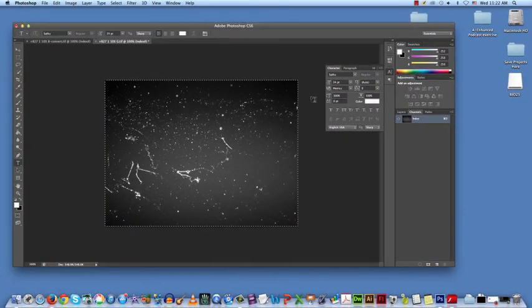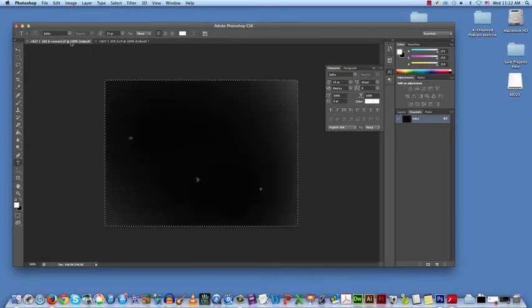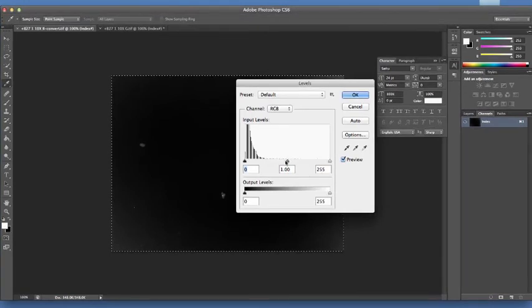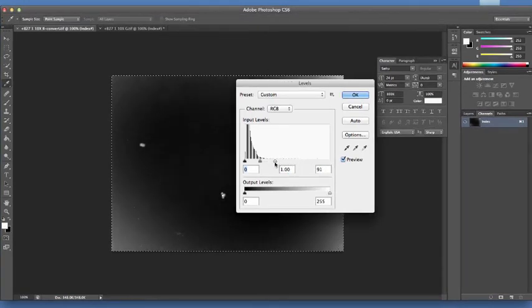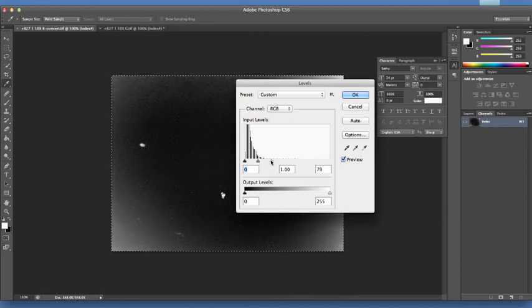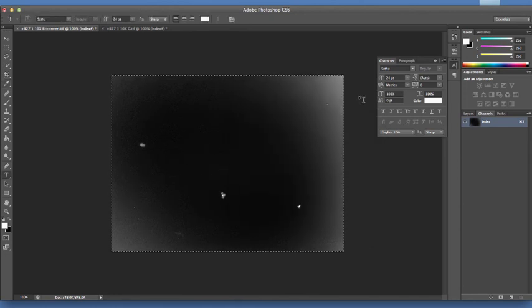So we'll say OK here, and then go to the DAPI image and do the same thing, adjustments, levels, and see if we can bring up those nuclei. There's only a few nuclei here. Again, if I go too far, I'm bringing up the background, and that's just not important. We don't want that information there. So I think that's going to be the best option for me.